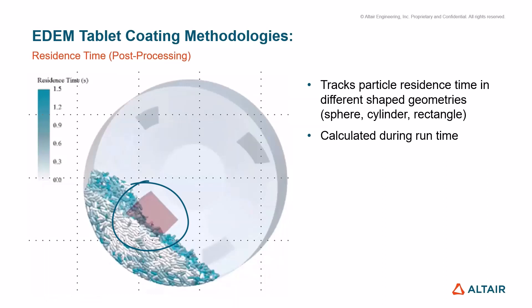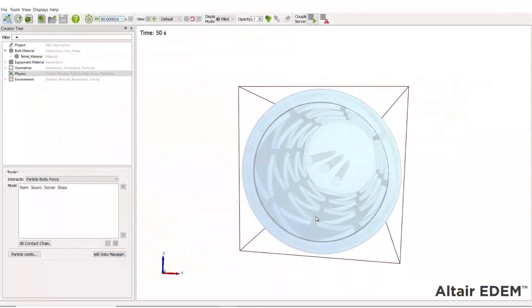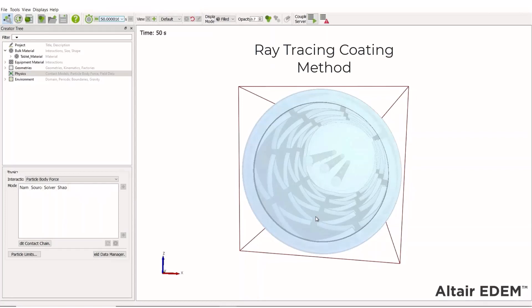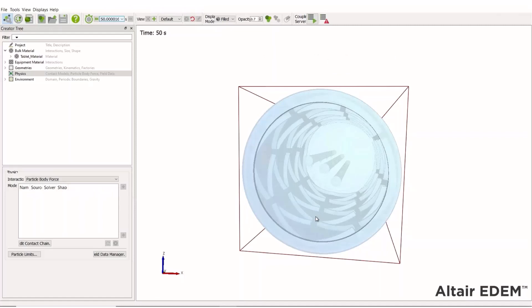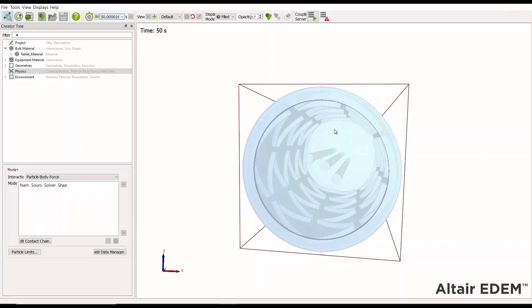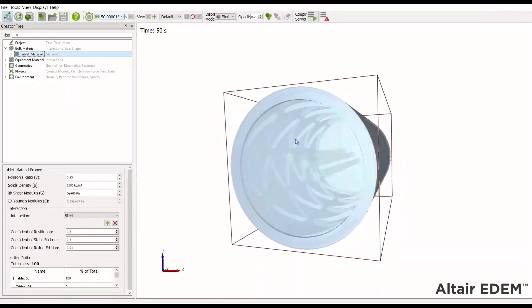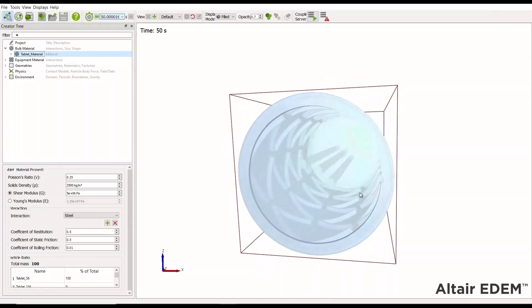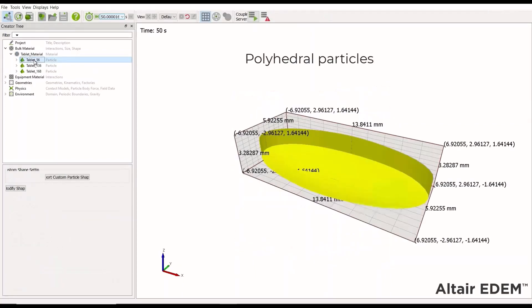The residence time method allows you to do analysis of the tablet residence time in a specific predefined spray zone, and this also calculates at runtime. This simulation has already been set up and run with the ray tracing coating method. This has the advantage that we can run all the post-processing after the simulation has completed, meaning we can run one simulation and then do the analysis of different spray zones without having to rerun. This is a generic tablet coat equipment filled with polyhedral particle tablet material.